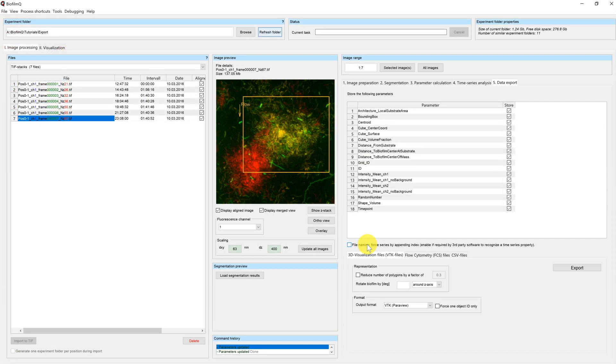Welcome to this Biofilm Q tutorial. My name is Eric and today I will show you how you can export the extracted parameters to different file formats.